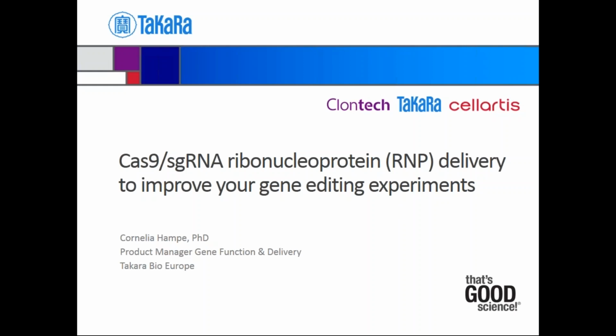So thanks for joining today's webinar, in which I would like to focus on the benefits of Cas9 guide RNA RNP delivery for gene editing experiments.